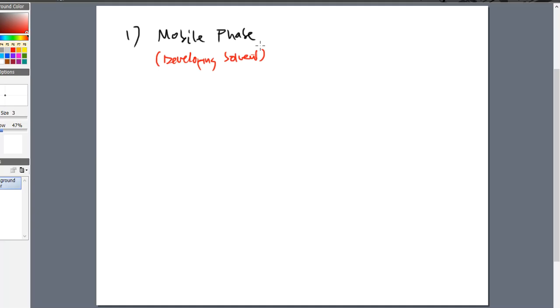So we're going to make our mobile phase, and that's often the very first step. If you are under a method developing stage, so you're like research and development, that's okay. You're just going to do trial and error. So the trial and error, you're going to run it, see how it looks, change up something a little bit, go run it again, see if it got better, see if it got worse. And you're going to change these typically with very small percentages in the very beginning.